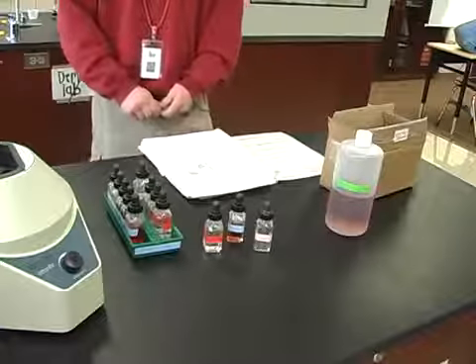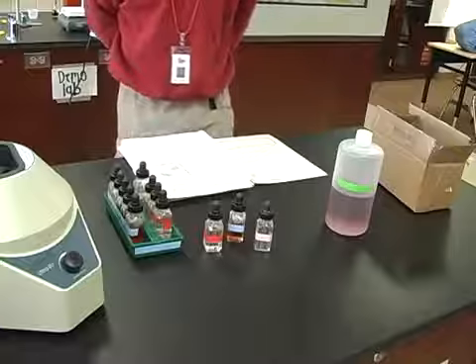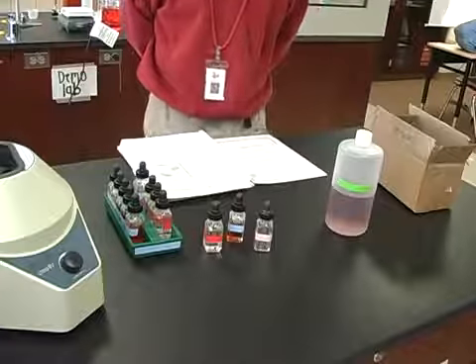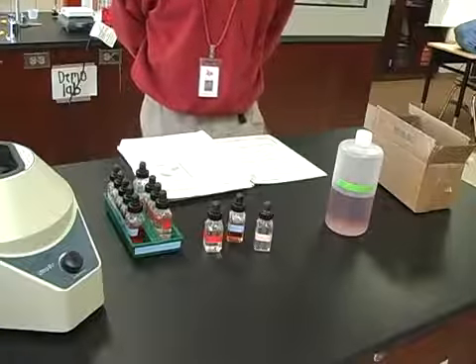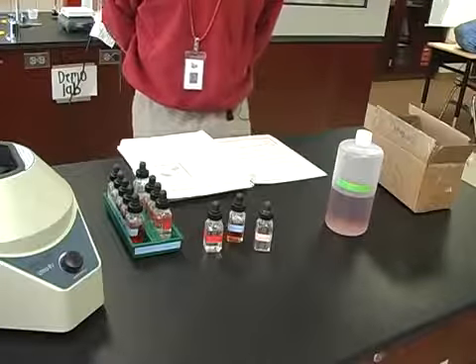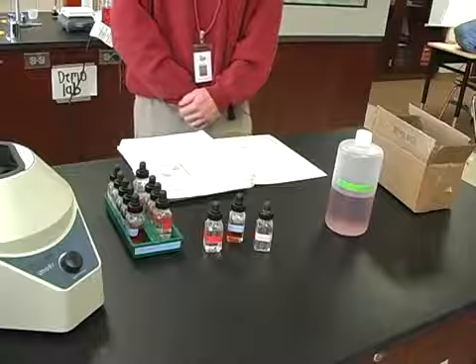Okay, we're on the second page now on the topic called avoiding contamination. Tap water is often a source of contaminating ions. Wash all glassware and rinse it with distilled water. A stirring rod is constantly used to mix solutions, and it must be rinsed with distilled water so it does not contaminate subsequent solutions. An easy way to do this is to fill a 400 milliliter beaker about 2/3 full of distilled water and keep your stirring rod in this beaker. A small amount of contaminants present in this volume of water should cause no problem. Replace the distilled water if it appears to need it.